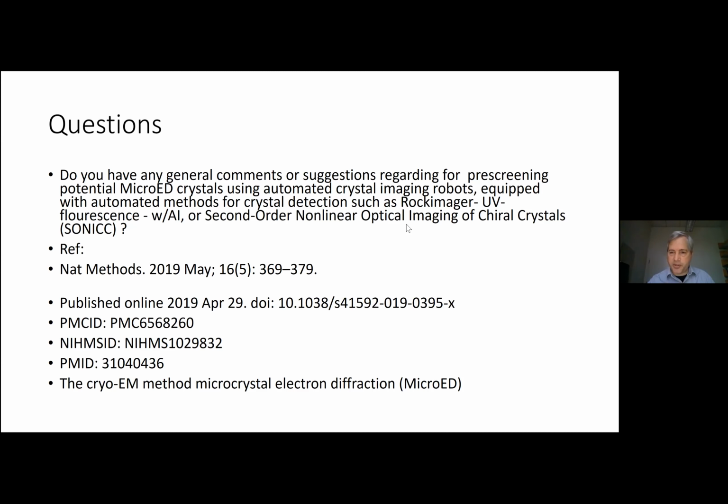Are most crystallization buffers used in X-ray work compatible with MicroED? I think so, yeah. Normally for single particle, you don't want to have things like PEG and carbon containing things like glycerol, which are used as cryoprotectants or as crystallization agents, because they would lower the contrast. But because you're looking for crystals, and the crystals are these big solid objects, you're not as hurt by that. So I think most of the crystallization buffers are compatible with MicroED.